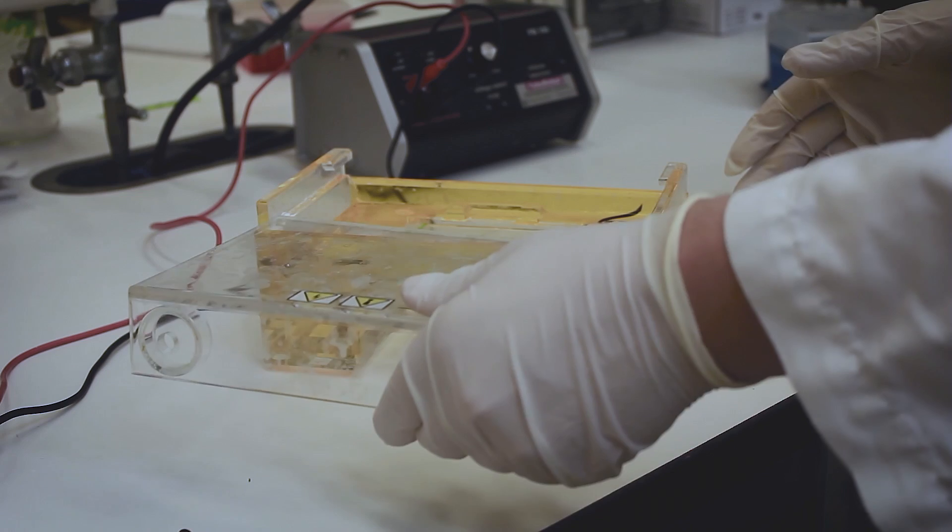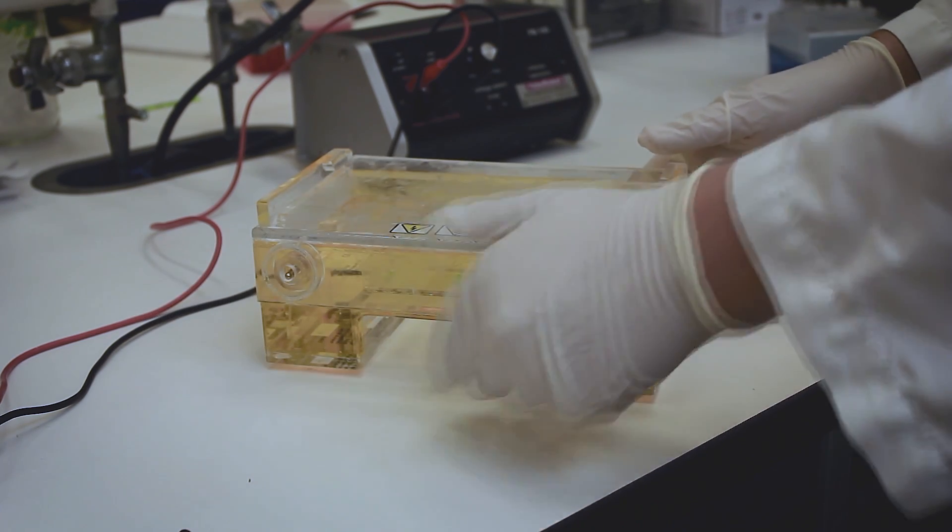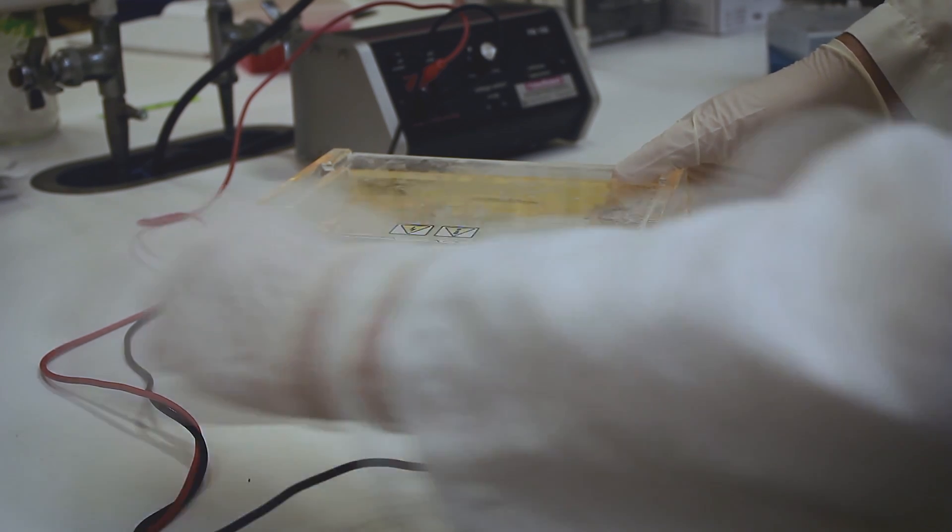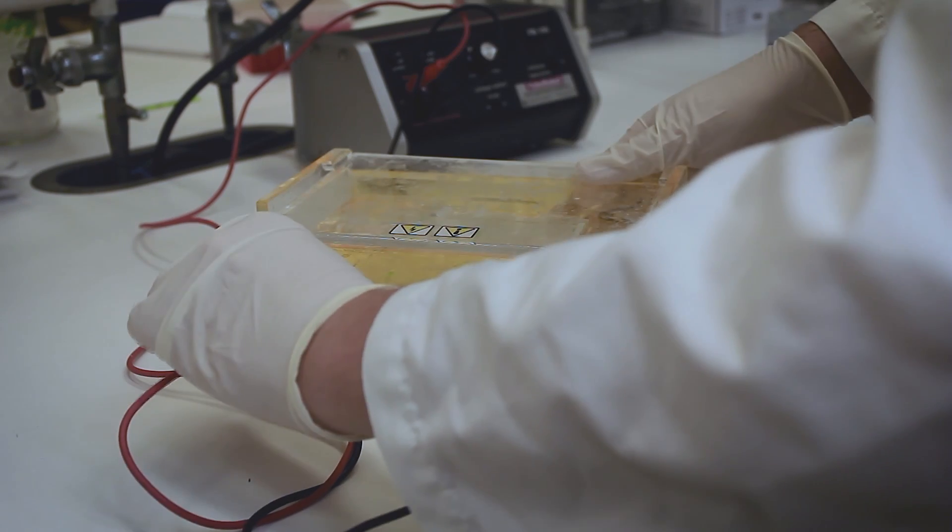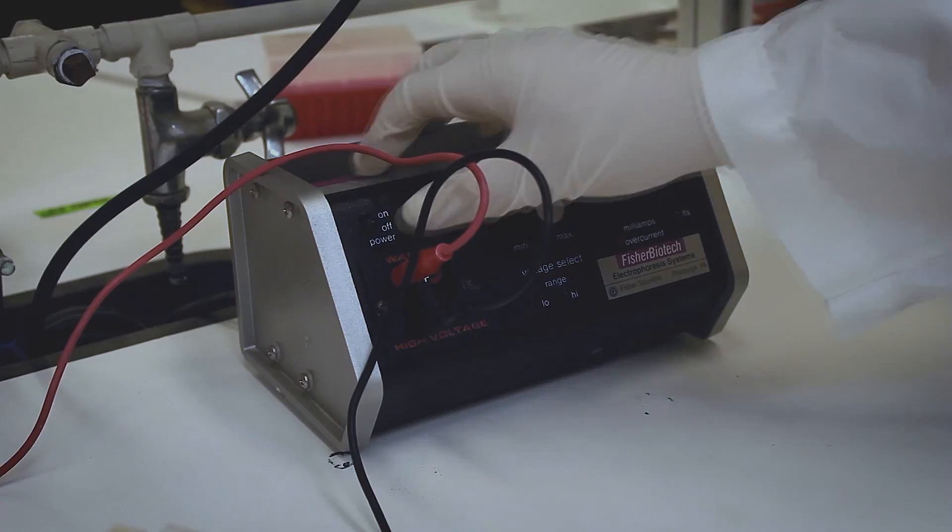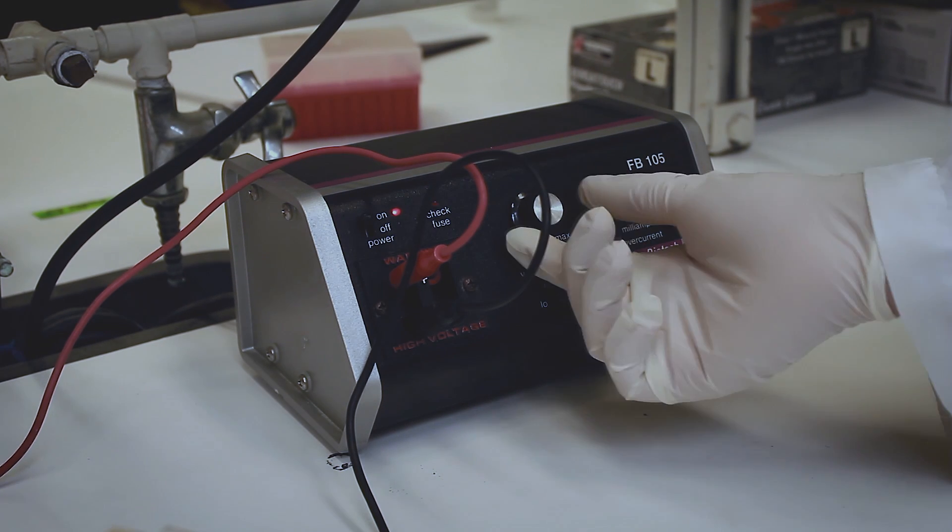Once all products are placed inside their individual wells, place the cover on the gel box and turn on the power supply. Be sure that the power supply is set to about 106 volts. Let the gel run for about 20 minutes.